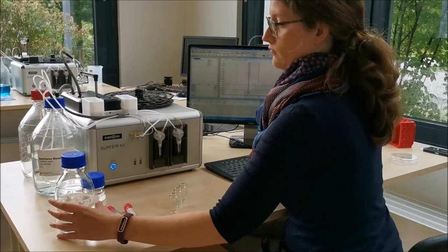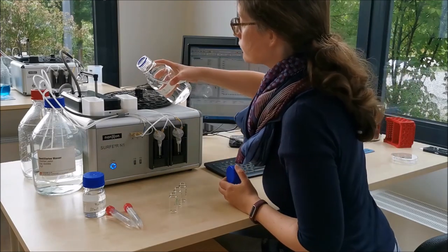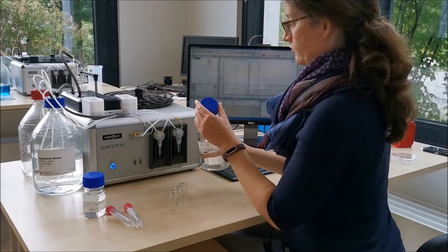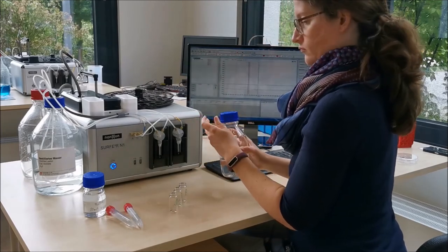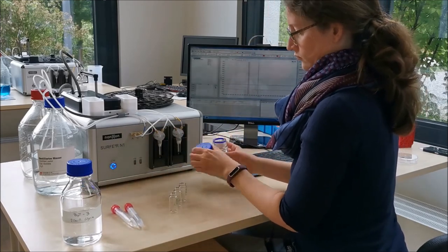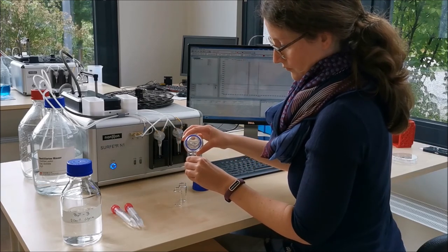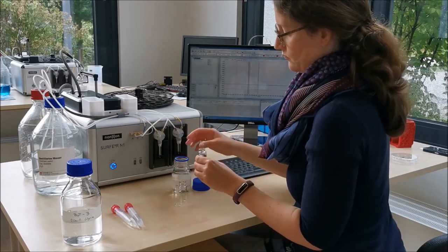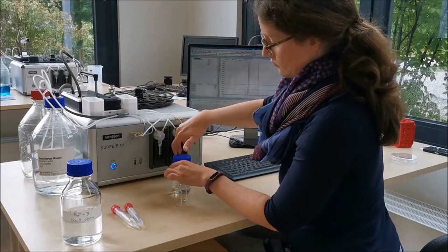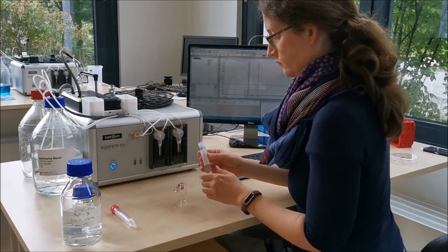During initialization, Maria provides the measurement solutions to the instrument. Here, Maria is adding the non-activating solution into the right reservoir of the SURFE. Then we have prepared 3 different activating solutions, containing different substrate concentrations. Maria is adding those to 3 different autosampler vials. The activating solution with the highest concentration is inserted at position 1 of the autosampler, and the lower concentrated activating solutions follow at positions 2 and 3.